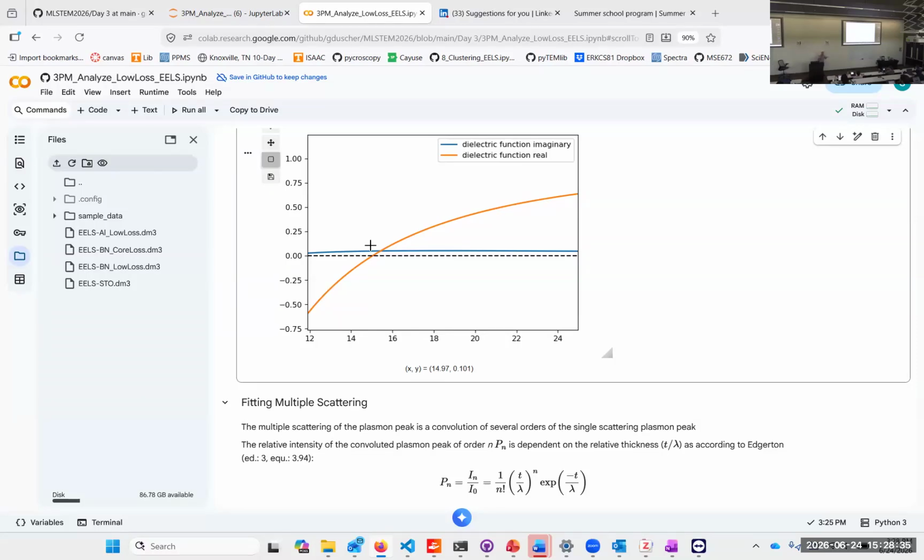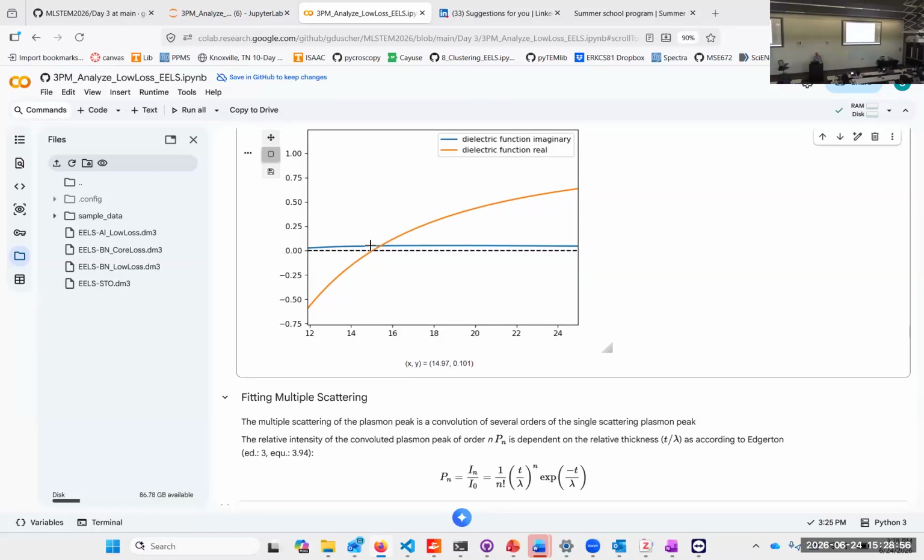So anything that is damped very fast, so you can have oscillations of less than one. Okay, so that would be then a very broad plasmon peak. And so the amount of how well this eigenfrequency is not damped, that is how sharp this peak is. So in our case, it's very sharp.